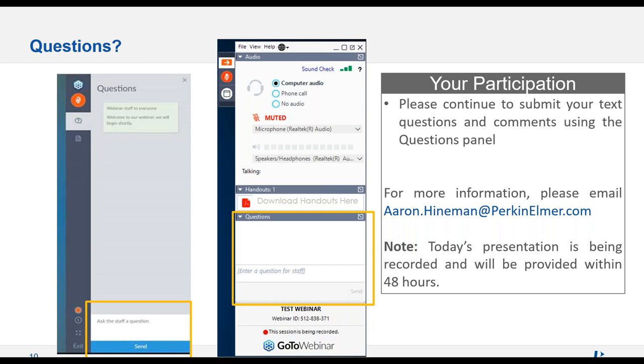Another question. The next question is, why do we need to do lithium separation? Can we just measure it directly? Yeah, well, actually, you can. The issue is really the other alkalis in there.